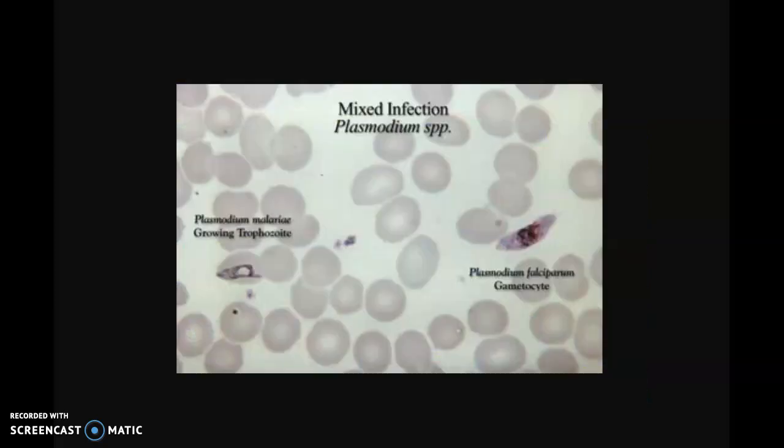Switching gears again now to protozoans. Remember, protozoans are closely related to algae in terms of their kingdom. They're both in the protist kingdom, but the protozoans have more in common with animals than they do plants, in that they don't photosynthesize, and a lot of times they don't have a cell wall.